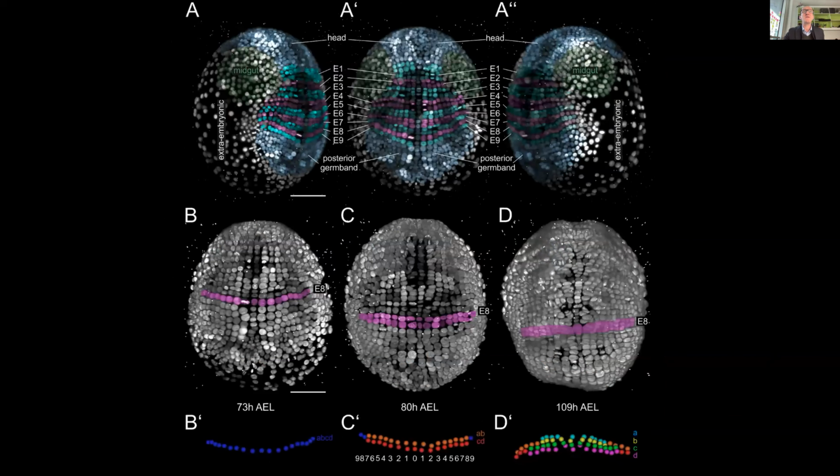And pushing that, they've seen something incredible, right? One layer of the cells that you see here will give rise to 2 parallel fingers of the shrimp here. Again, I'm a physicist, and I find this incredible. In the beginning, this is an early stage of the embryo, it's still an egg, and you have something spherical, but the spacing of the cells here is on a square lattice, which I find incredible. There's a huge amount of data from this single image that we haven't yet dug into, but it will come.